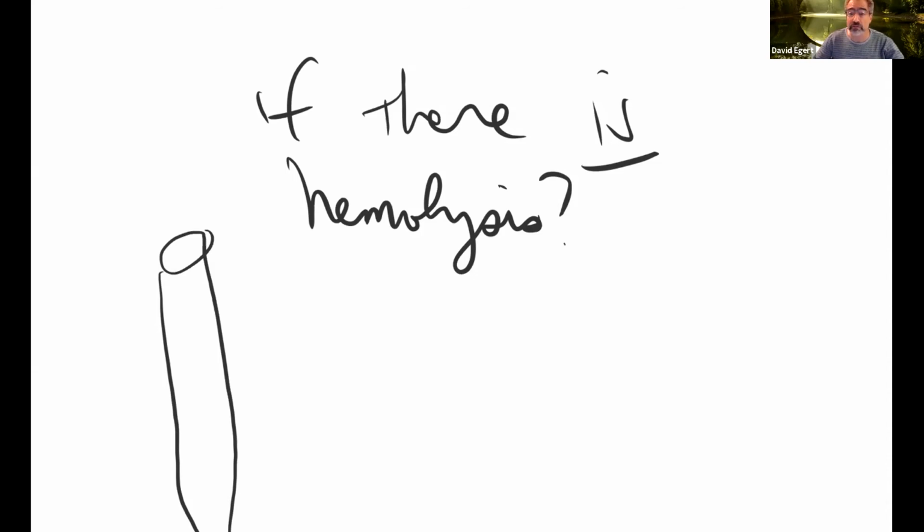That's what gives them their red color. So this is looking red, but now it's not just red blood cells. It's actually just loose free hemoglobin, which are just molecules. It's no longer big cells with 250 million hemoglobin molecules. It's just hemoglobin in solution.